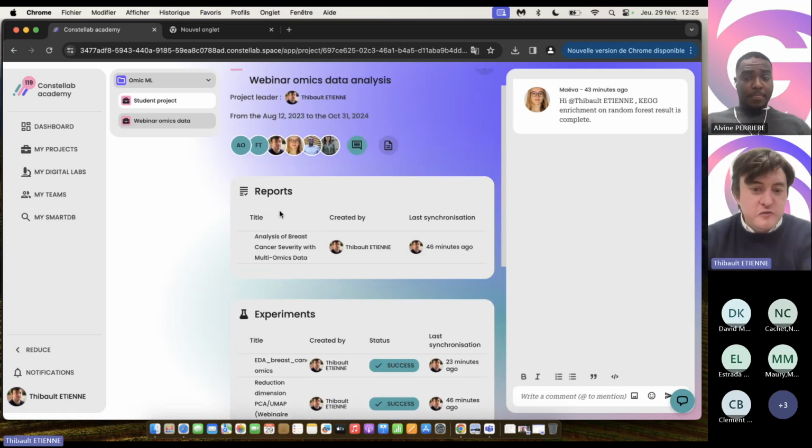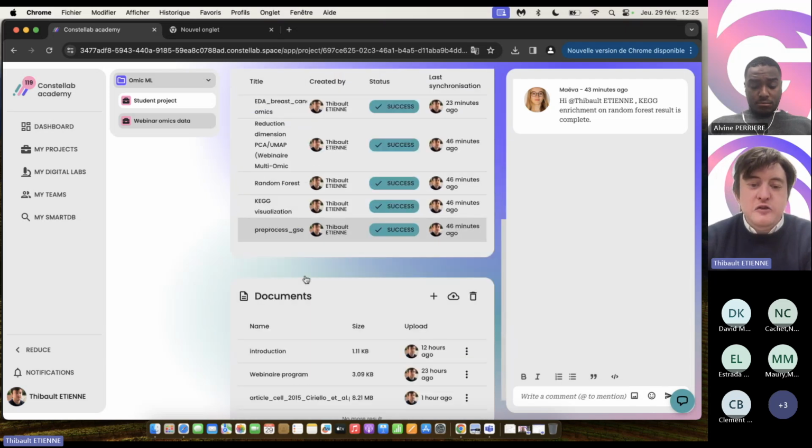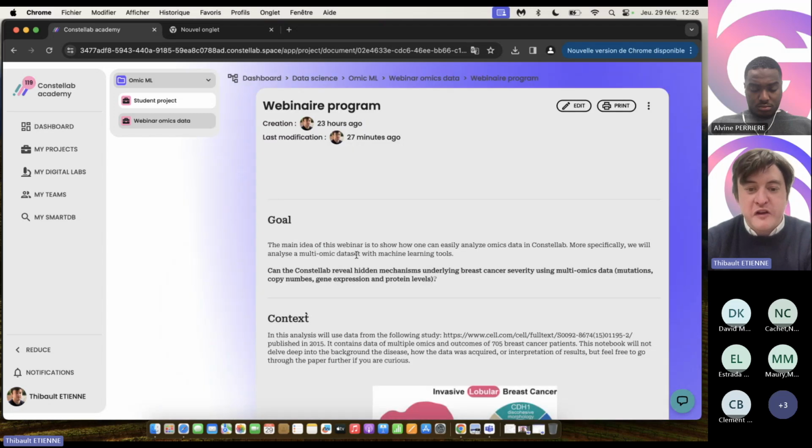At this level, we can find a section for reports, a section for experiments run on the lab, and a section for documents. This section is, for example, to exchange a PDF or to write short reports directly on Constellab. For example, I will present the program of this webinar.